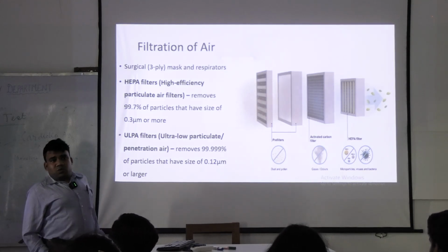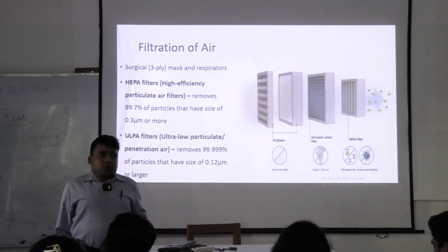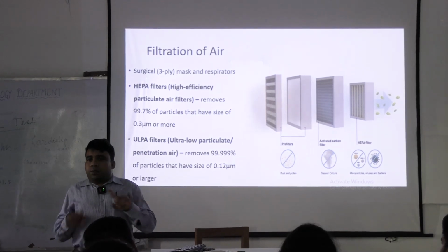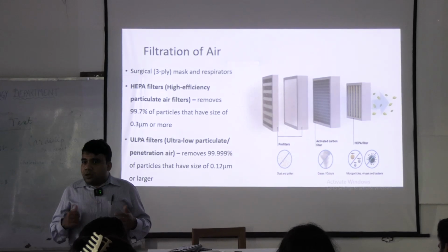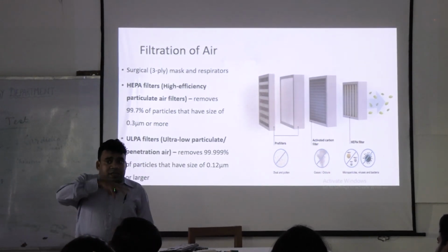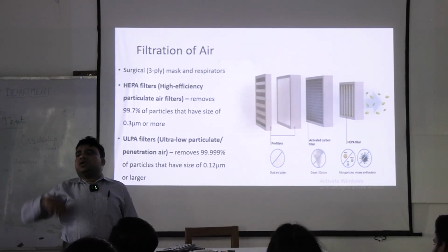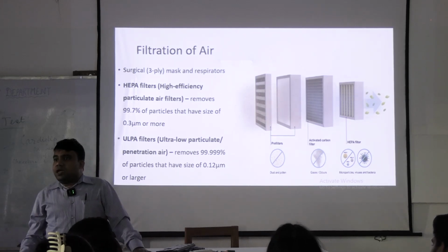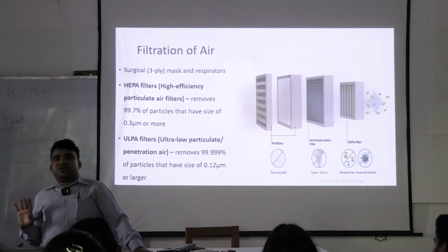Now next comes the question, why do we need to filter air in the first place? Two specific requirements. First is, in the last class I have shown you a biosafety cabinet, a cabinet that is designed to protect us when we are working with infective organisms. The air flows from the bottom of the cabinet and is sucked into the HEPA filter. If there is any organism which comes out within the cabinet, it will be sucked in by the HEPA filter. So we don't get infected. That is the very first use.